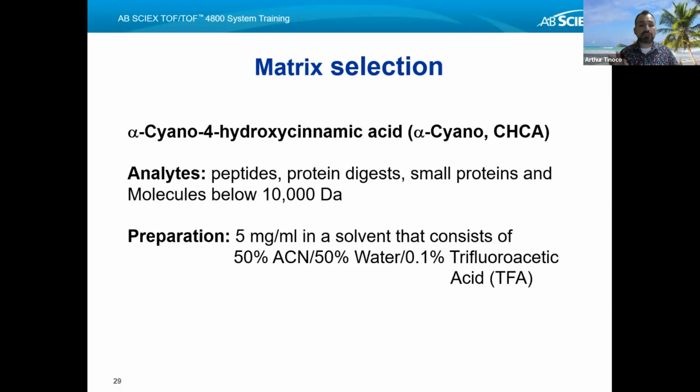I can show you different ways that I've been able to get around this issue in order to see many different types of samples that are not soluble in water, and even if they're not soluble in acetonitrile. Now, you may wonder why the trifluoroacetic acid. The reason for this is that it provides a source of protons, and protons are one of the major adducts that are formed with your samples to give you charged ions, right? So that's a really important part of the use of TFA.